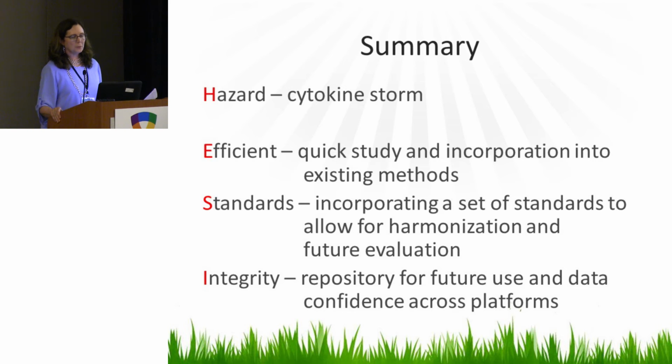So I was really careful to say lack of predictivity for massive cytokine storm, because there were hints in the preclinical data that something was up. And actually we have looked at least at Pfizer, and also some of the papers related to the CD28 superagonist, they did look at differential responses across species.